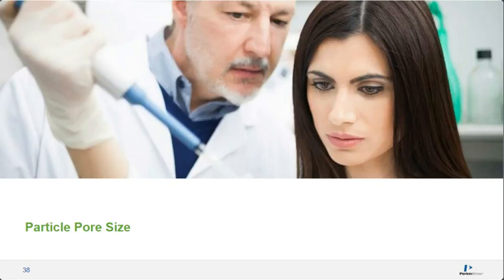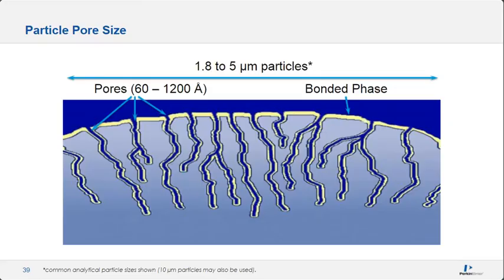Now let's take a look at the effect of particle pore size. We could see typical particles anywhere from 1.8 to 5 micron would contain pores generally between 60 and 1200 angstrom. The bonded phase is actually bonded to the surface and is contained within the pores of the silica particle. A silica particle generally has a range of pore sizes, generally 60, 80, 100 angstrom, 120, and so on, all the way up to 1200 angstrom.